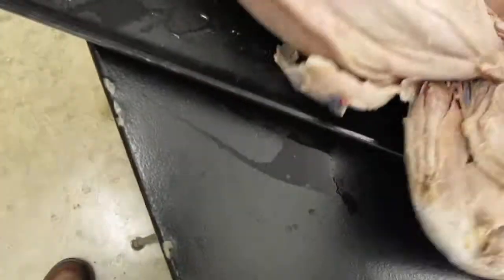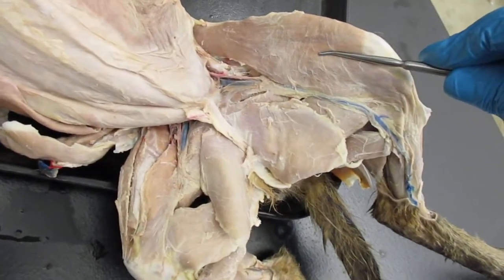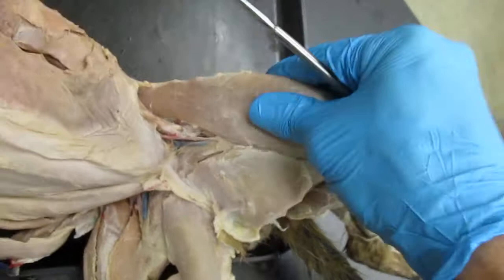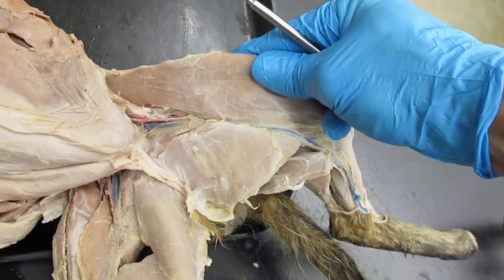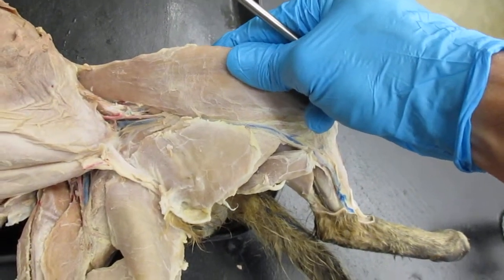Sartorius muscle is going to be this muscle right here. So here's your sartorius. Here's the gracilis muscle right here. So the sartorius muscle on the cat is going to cover your quadriceps muscles, and I'll show you that in a few minutes.